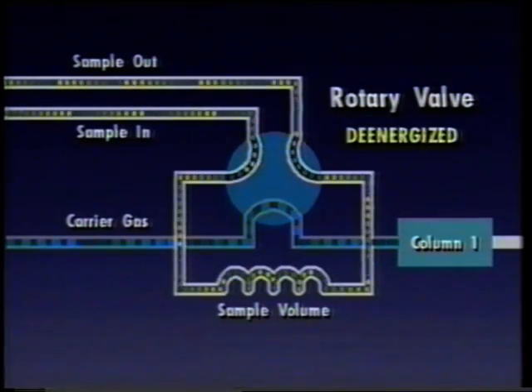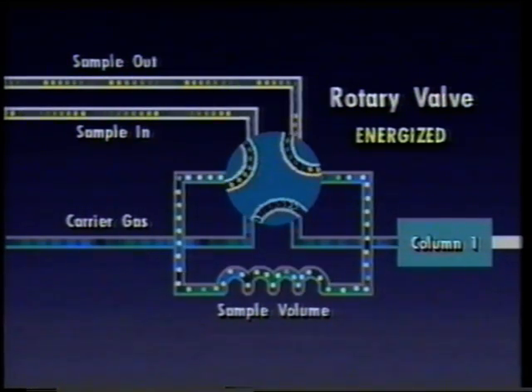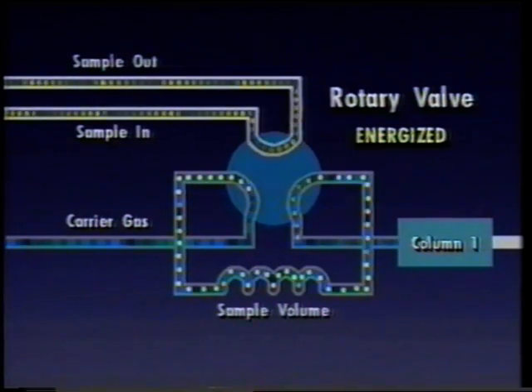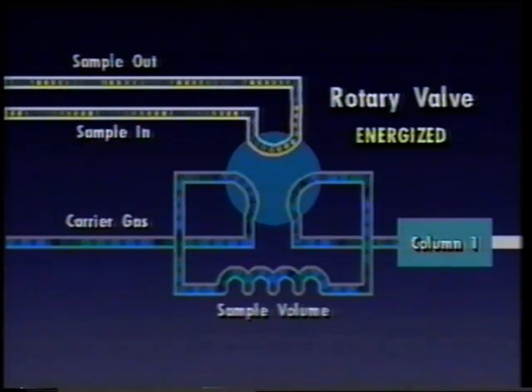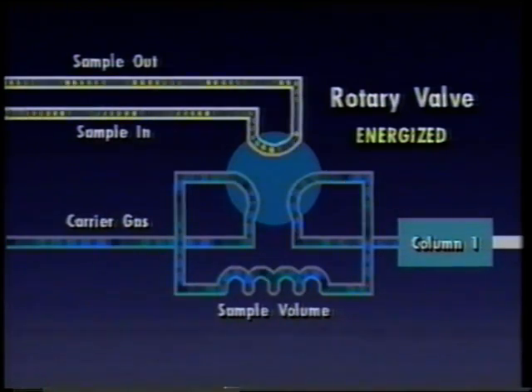The rotary valve uses a sample transfer technique which is similar to the slider valve. In the de-energized or rest position, process sample and carrier gas flow through separate chambers of the rotary valve. However, to inject a sample, the valve rotates 60 degrees, redirecting the sample flow and allowing the carrier gas flow to sweep the process sample into the column. Check the rotating parts for cleanliness, abrasions, and corrosion. Damaged parts should be replaced.